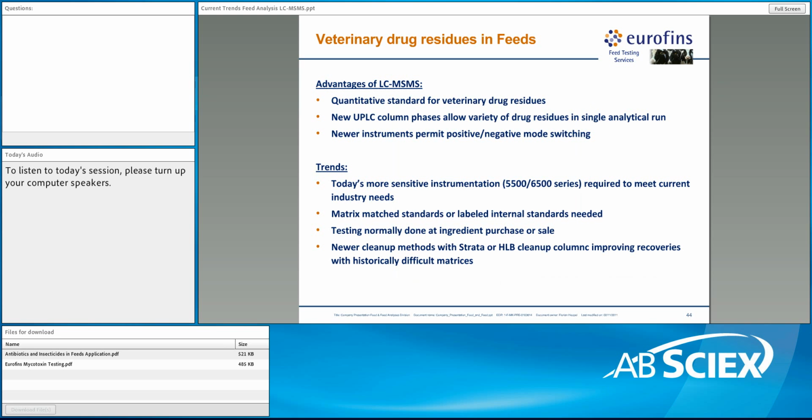So as a final remark, we intend to continue to use LC-MS/MS methods for improving or furthering the use of our technique, improving our techniques for the analysis of active ingredients in medicated feeds. The next topic is another very important area these days that we're seeing a lot of interest in, and that is the determination of low-level drug residues in feeds that are used in industries that are highly sensitive to the presence of low-level veterinary drugs.